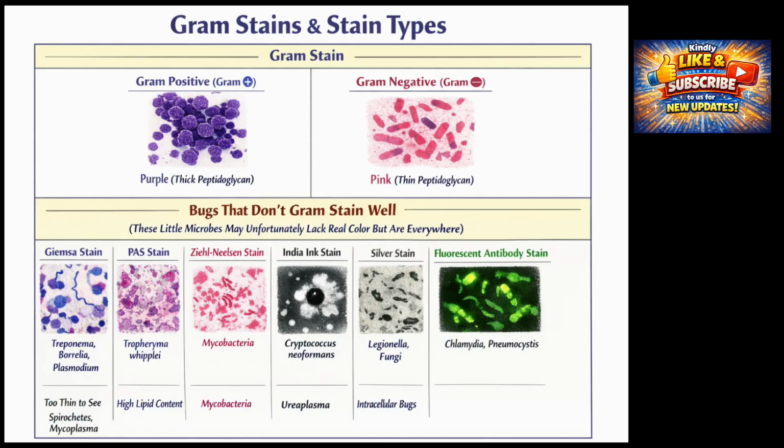Overall, understanding bacterial staining depends on linking the chemical composition of the cell wall or capsule to the interaction with specific dyes, recognizing structural limitations that prevent visualization, and connecting these features to clinical context, virulence, and treatment implications. This approach aligns with board expectations, which often test the reasoning behind staining results, not just memorized colors.